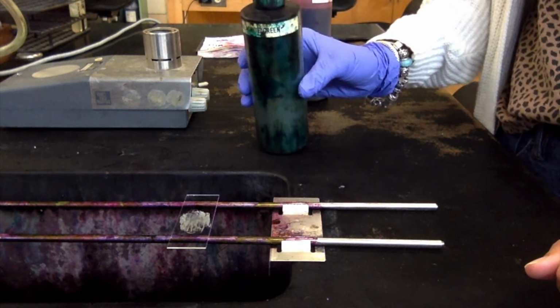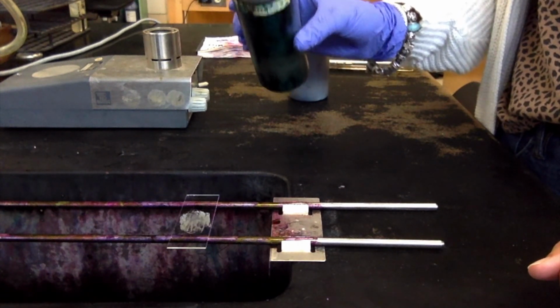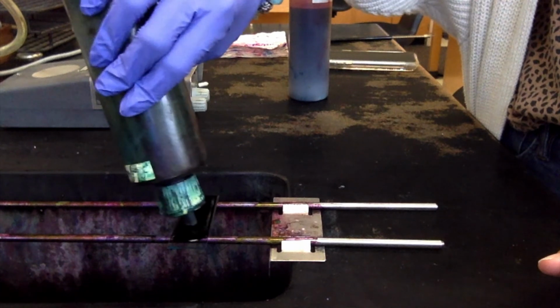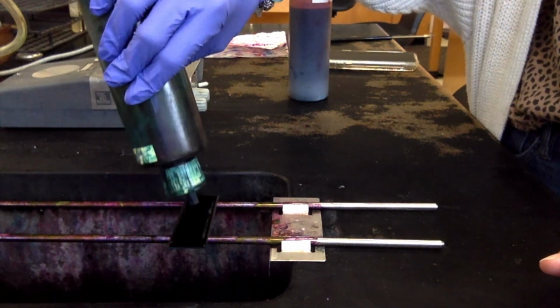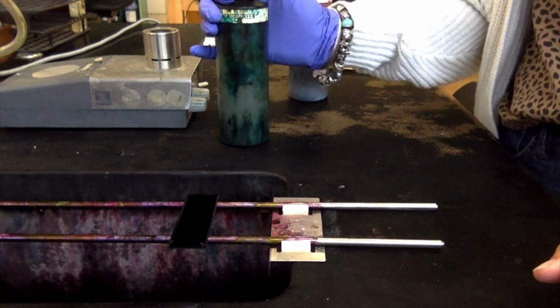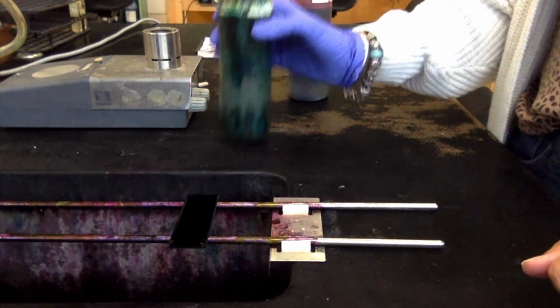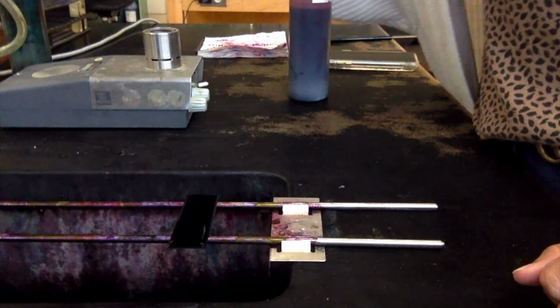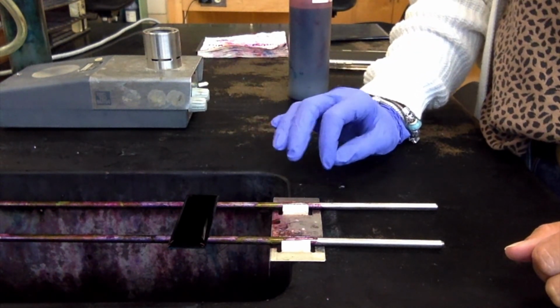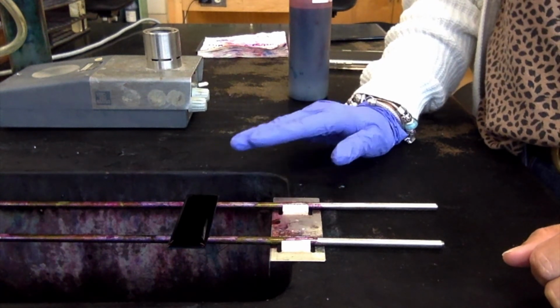So the first step is we are going to flood the slide completely with malachite green, and we're going to let it sit for 60 seconds. So flood the whole thing, and it's really important to get it all covered because we're about to heat this for 5 minutes. So we don't want our stain to dry up. Now, after we let this sit for 60 seconds, we are going to use our Bunsen burner and we are going to actually flame the stain.